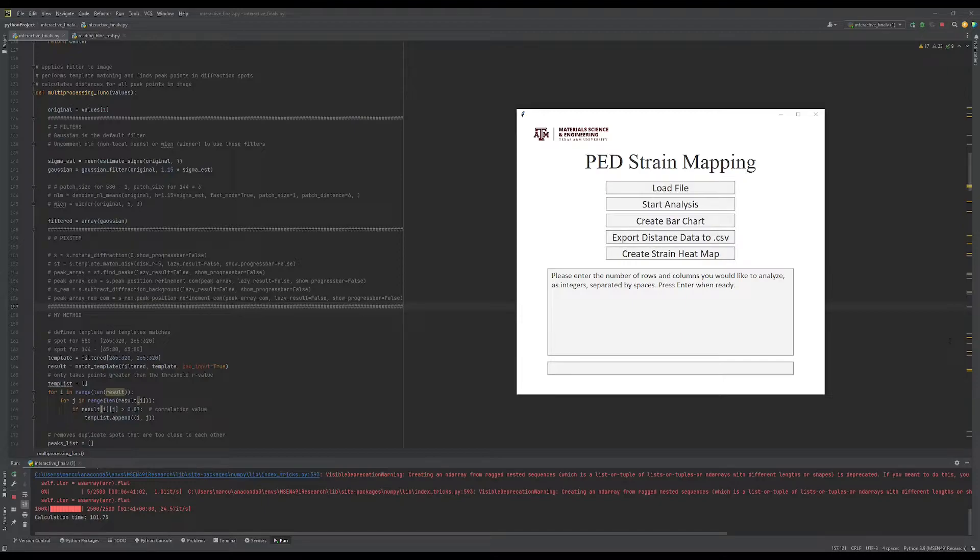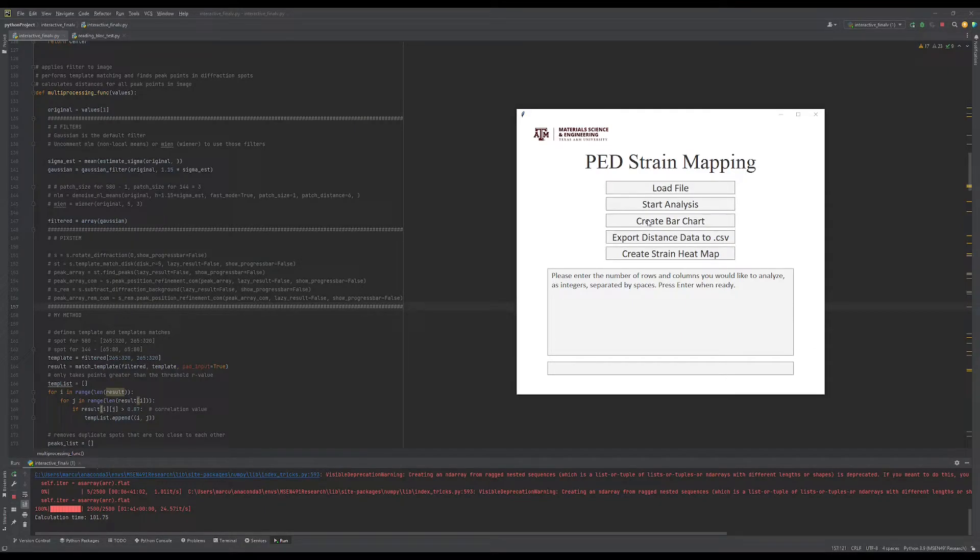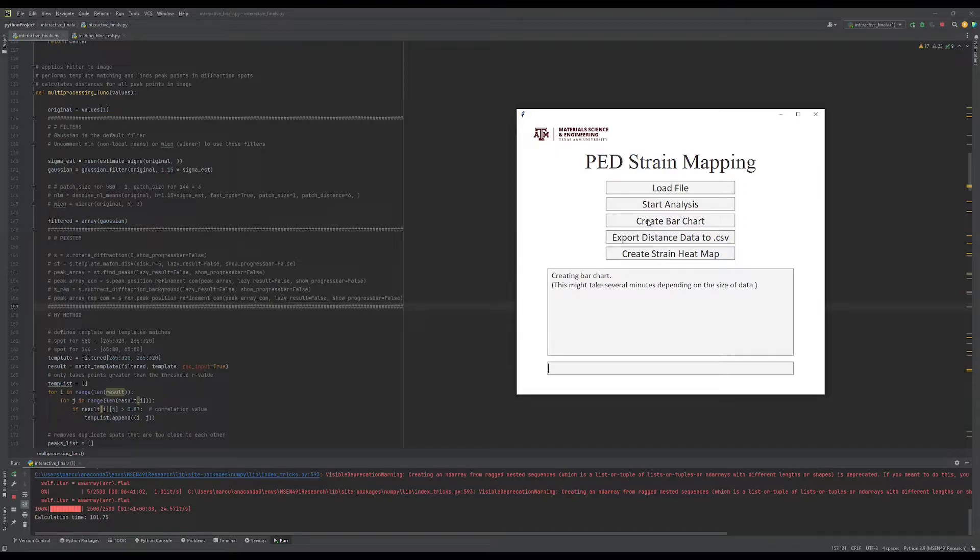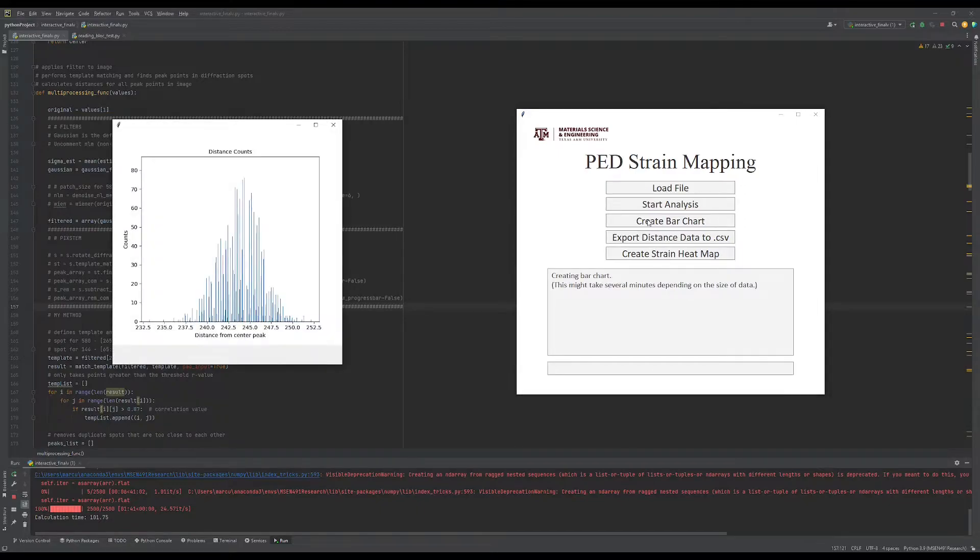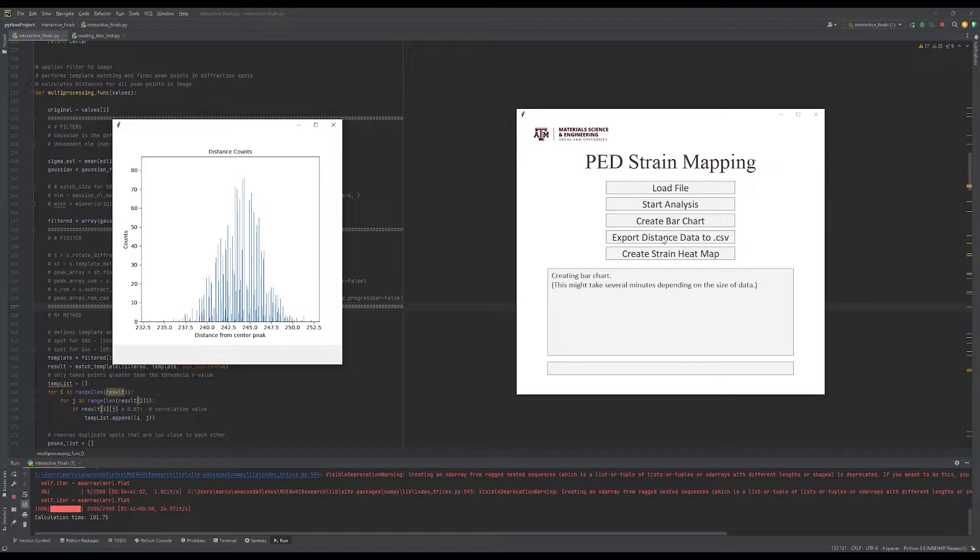After analysis is complete, we can go to the main window and click Create Bar Chart to help visualize the distance data. The data can also be exported to a CSV file for further analysis.